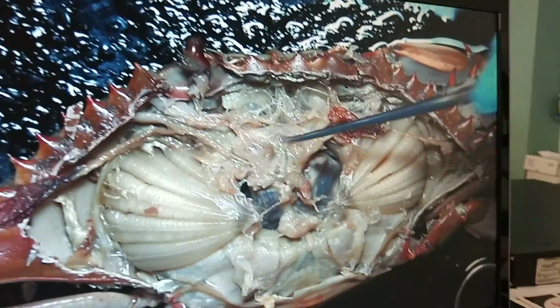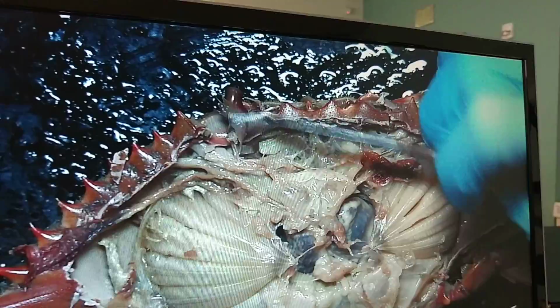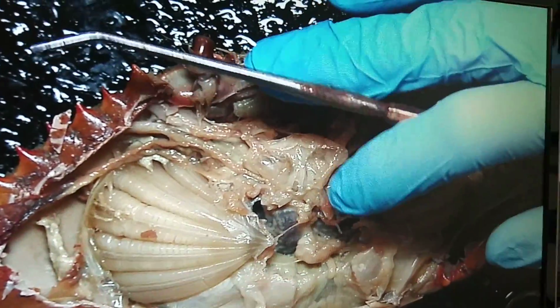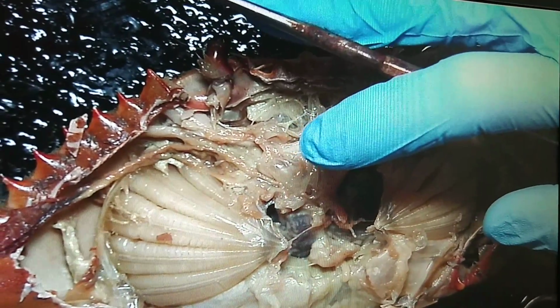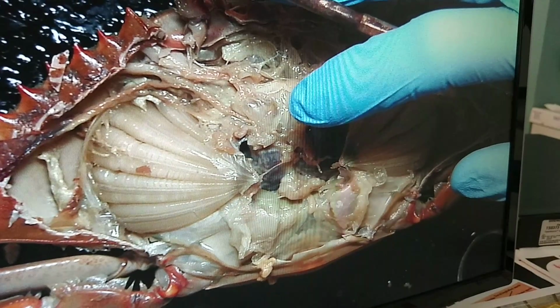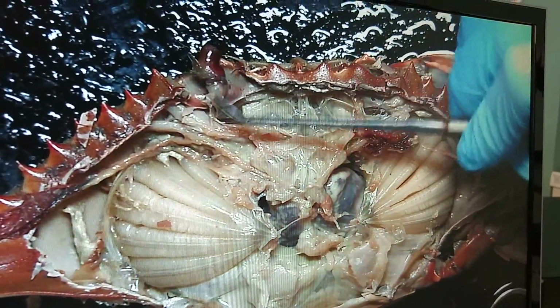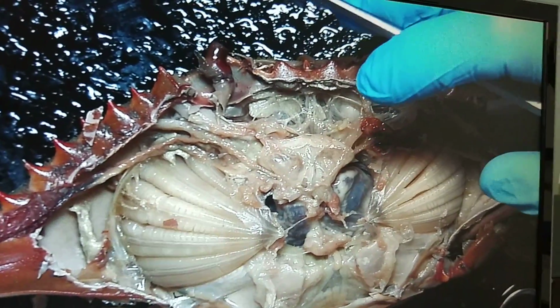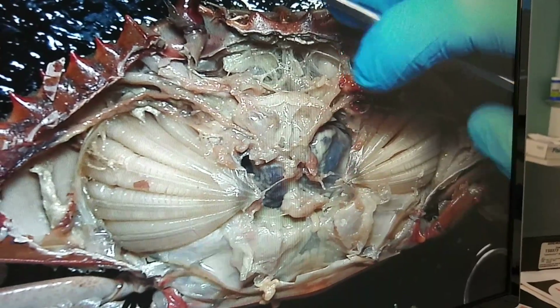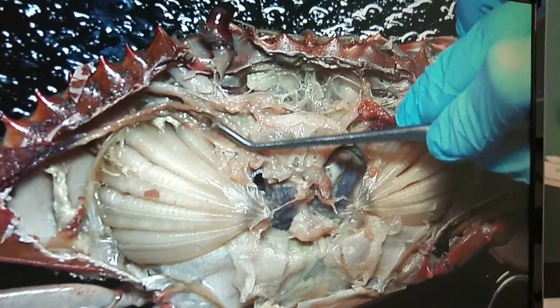Is the bladder different than the kidney? Like, are they the same area? So for the bladder, what you guys need to know is just listed on there, so don't worry about it. They don't really have true kidneys like we do. They do have modified nephron structures, and all of those are going to be near the antennal glands, because they're responsible for excretion. Can you point to the bladder again? So the bladder's going to be right here, at the base, which is kind of obliterated.